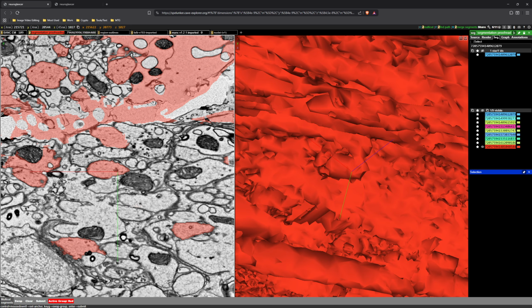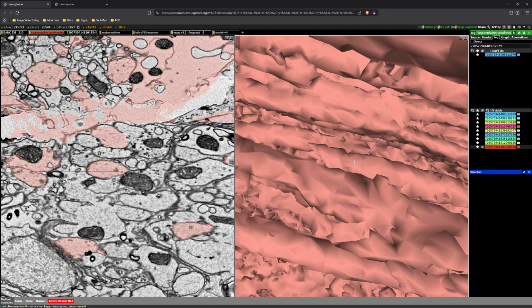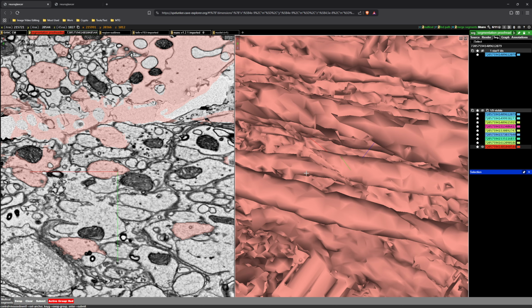So what just happened is a merger was removed within the segment that we were placing the points on, which is why it came back as a different color. But we didn't actually separate a segment from that merger. So this can happen sometimes. It's no big deal. The 2D segments were not placed. Let's try 3D again.